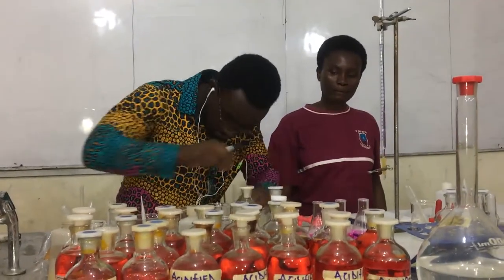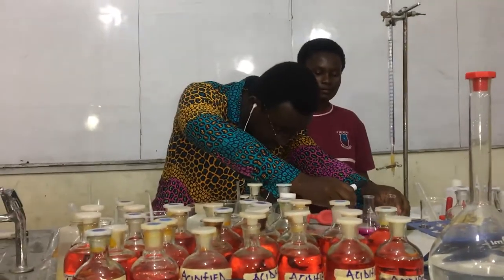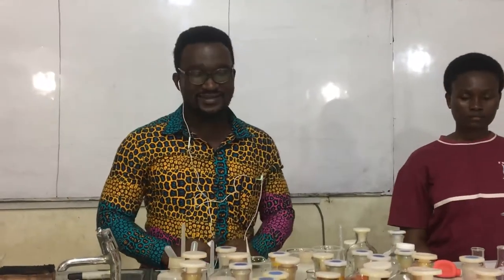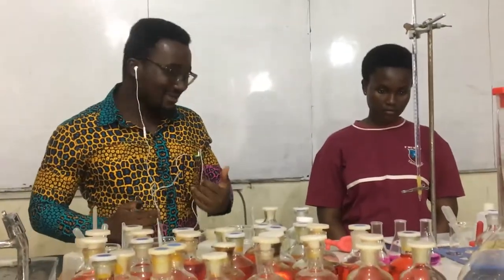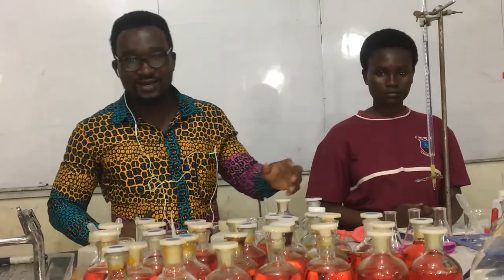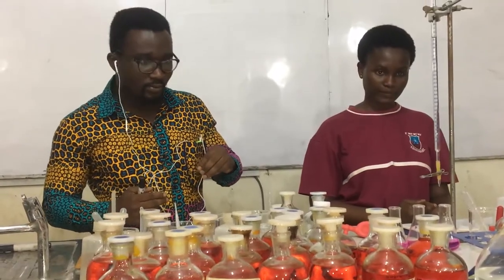So in fact, our madam has done well. She has gone through the titration. This is very, very perfect. Now, we are going to discuss the color. So pick the conical flasks one after the other. Then we discuss the volume.